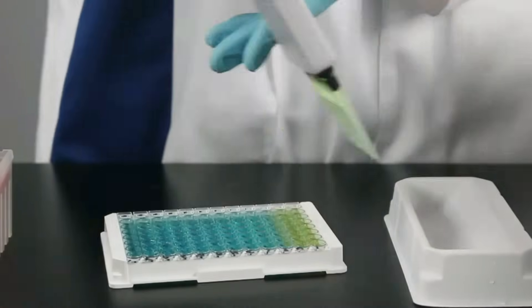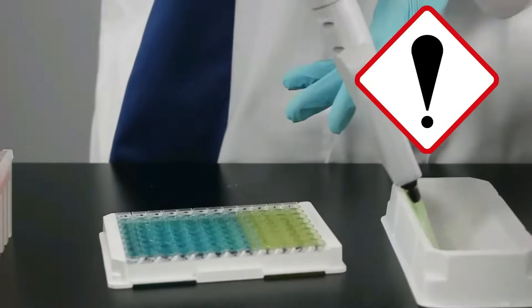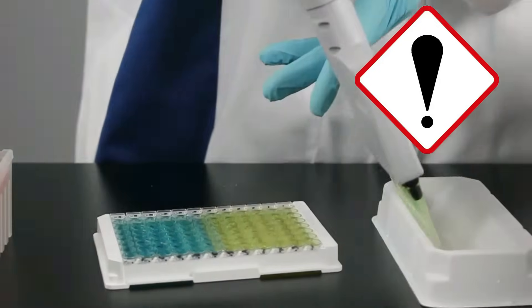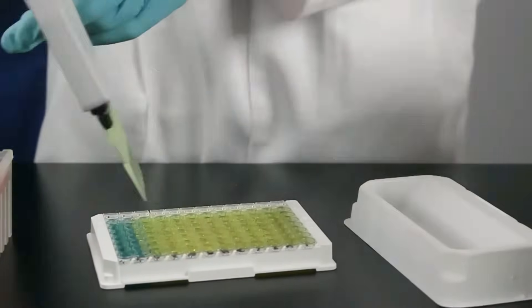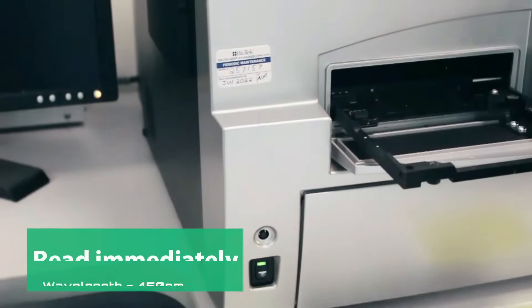To stop the reaction, add 50 microliters of stop solution. Be careful, it is sulfuric acid. This reaction will turn the solution from blue to yellow. It is important to read immediately, as too long of a reaction can cause precipitance.